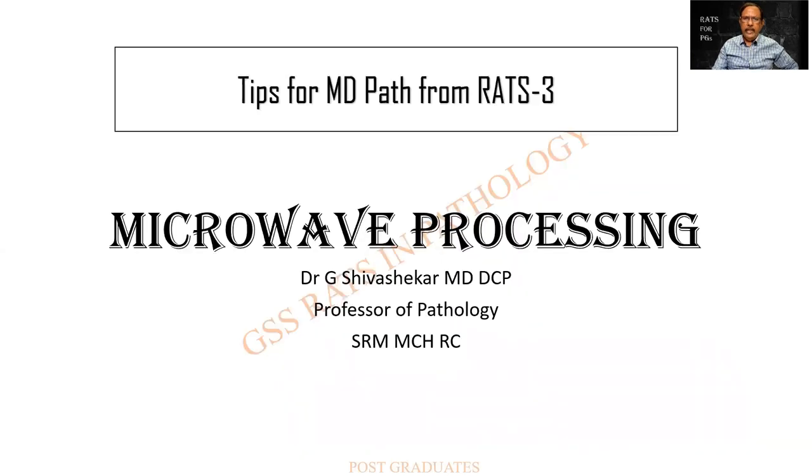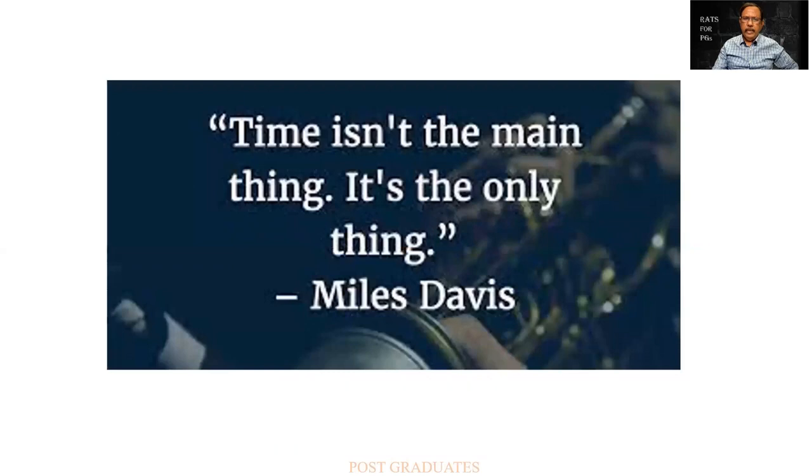The topic for the day shall be microwave processing. "Time isn't the main thing, it is the only thing." Miles Davis. A beautiful saying that could be applied in many a situation.